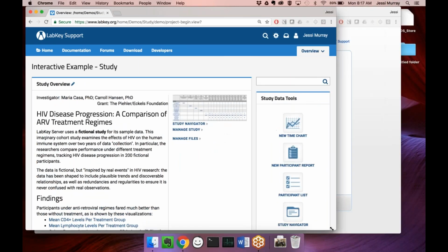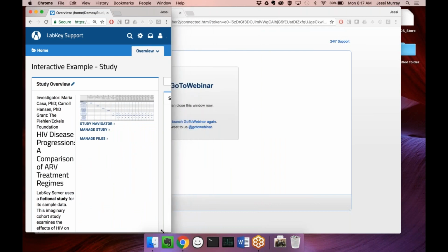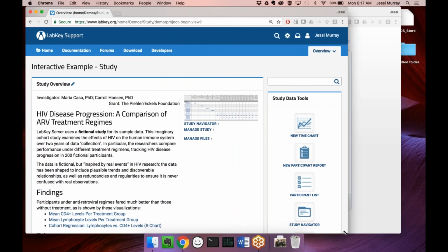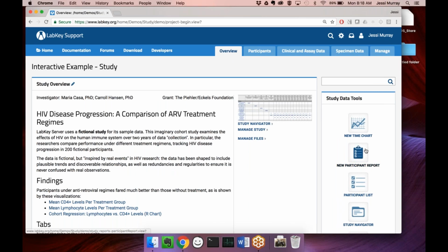We've also made it so that things lay out better at smaller screens to optimize for greater breadth of device sizes and types.